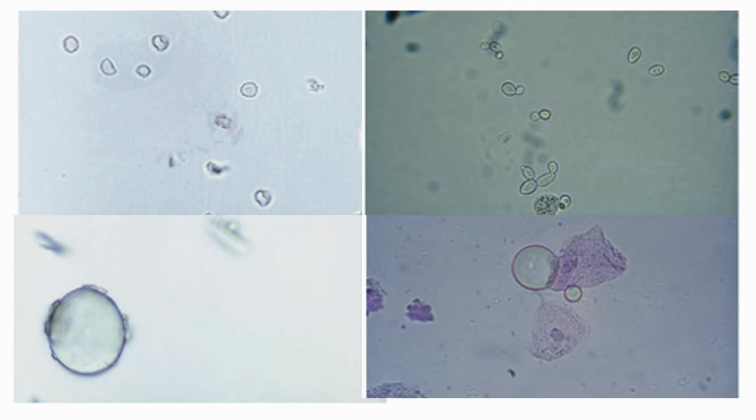So it's important that the dysmorphic red cells be distinguished from their common mimics, like the yeast cells, air bubbles, and even oil droplets. Dysmorphic red cells are seen here on the left upper quadrant, while you have the yeast cells on the right upper quadrant. Notice the presence of budding forms that aids in distinguishing them from the red cells.